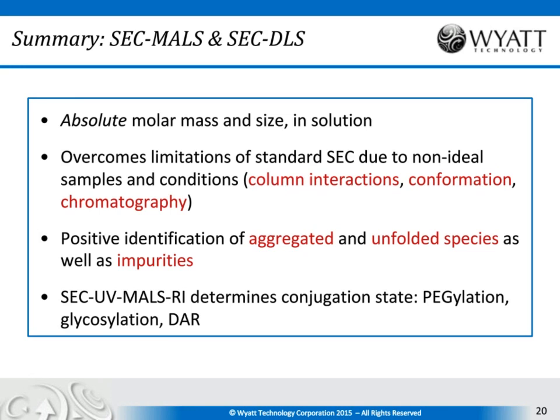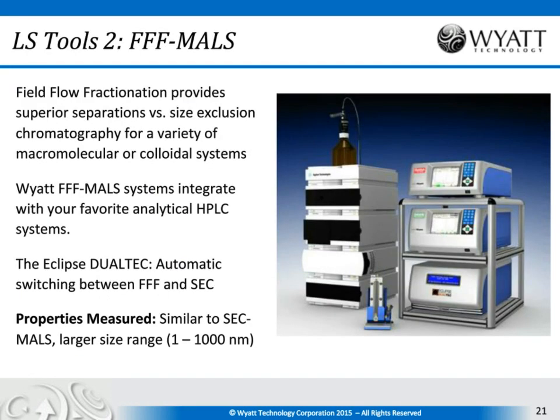Now the next tool that I'll describe is FFF-MALS. FFF-MALS is conceptually very similar to SEC-MALS. It's a separation technique which is combined with light scattering downstream of the separation. But sometimes SEC is not a suitable separation technique depending on your particular molecules or nanoparticles. It might be because of the size range that you're looking at. It might be because of column interactions.